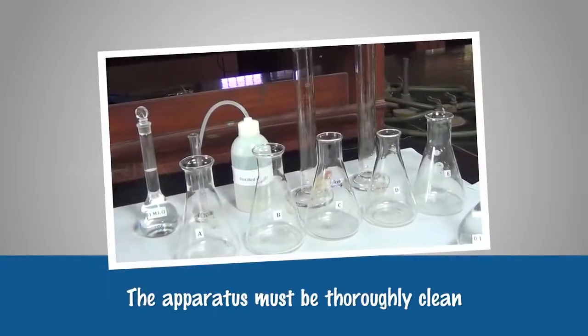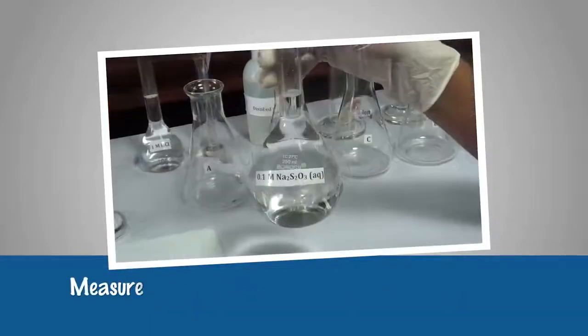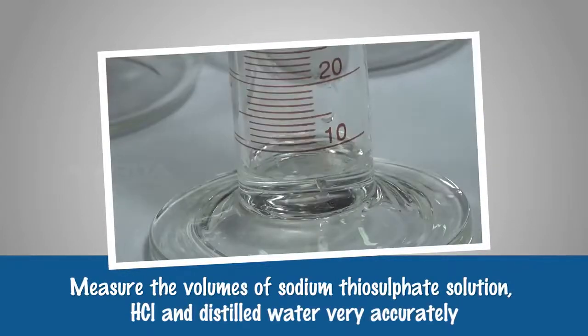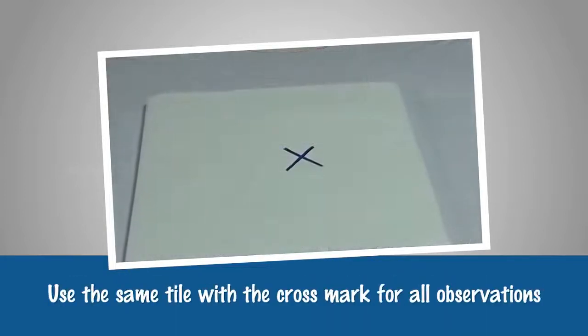Precautions: The apparatus must be thoroughly clean. Measure the volumes of sodium thiosulfate solution, HCl and distilled water very accurately. Use the same tile with a cross mark for all observations.